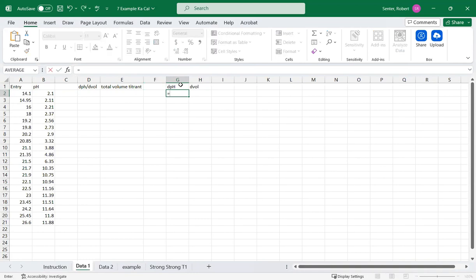So we're wanting the change in pH. So here minus here. So kind of showing it's going down. So just like in the lecture, we do final minus initial, and that'll make that sign come out. Just matching convention, right? It's increasing, so we want it to increase like that.